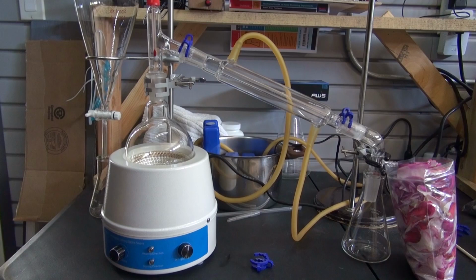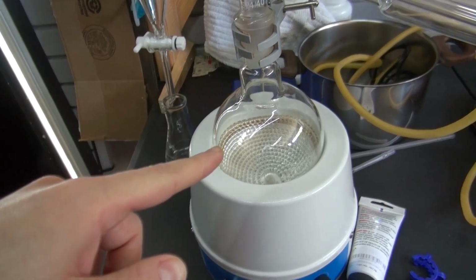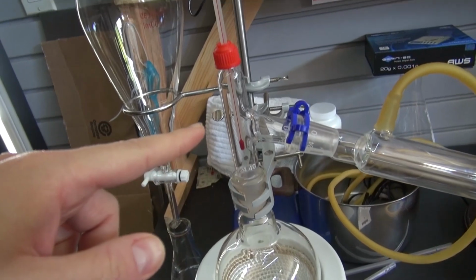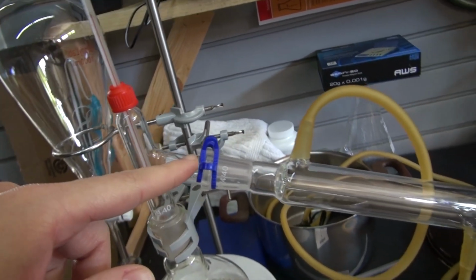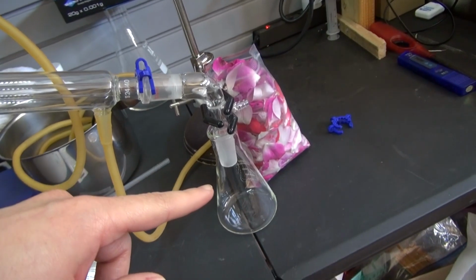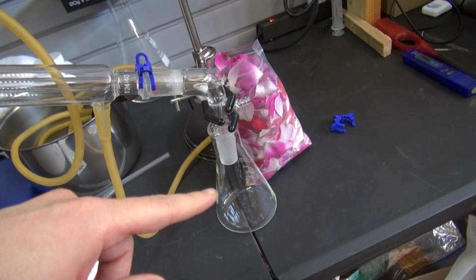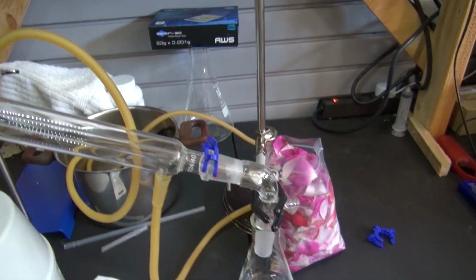And this is the equipment that you're going to need for this project. The items you're going to need are this 500ml Florence flask sitting on top of this heating mantle, which you can use to adjust temperature. The Florence flask is attached to this thermometer joint. This thermometer joint is attached to this Liebig condenser. The Liebig condenser is connected to this joint, which curves into this Erlenmeyer flask, where you'll be able to collect all of your distillate, in this case the rose water, or rose hydrosol.